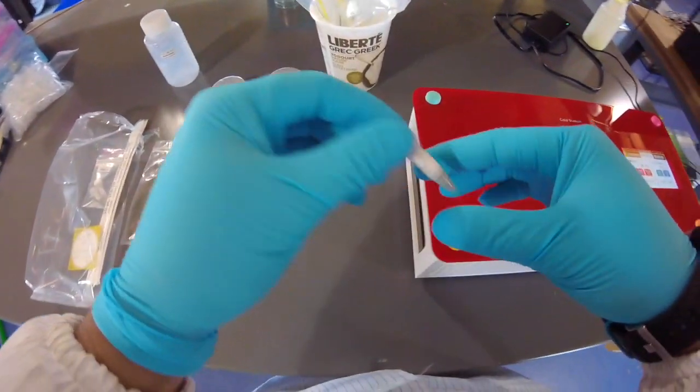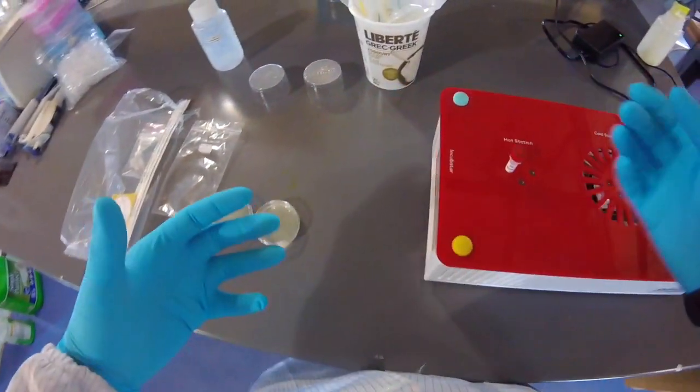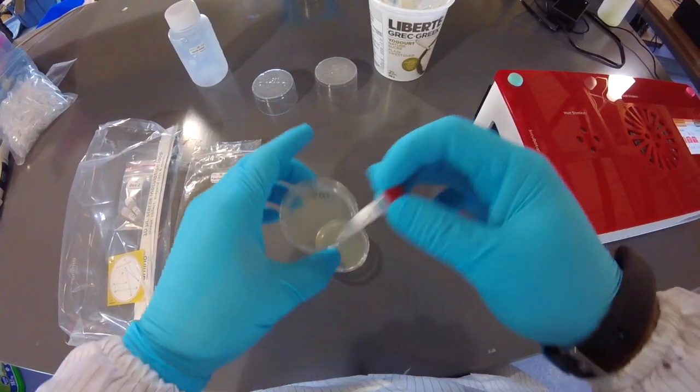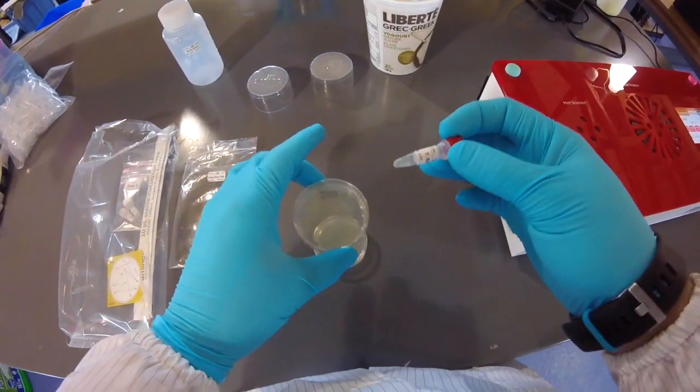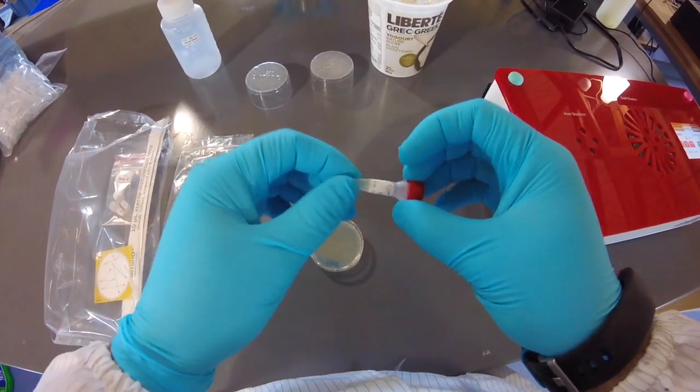All right, so now we're going to do the last step, the day 3 steps, which is essentially to pour half of our engineered cells onto the Petri dish and spread them out. You only need half because that should be plenty of cells in there.